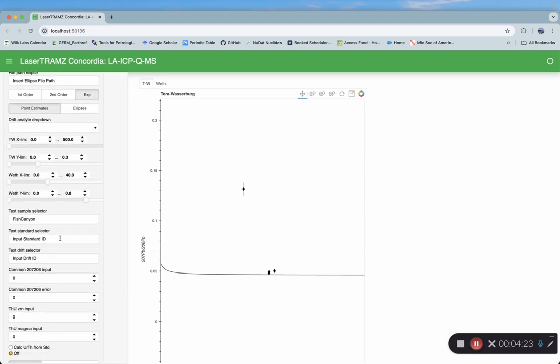Okay, the standard that you want to use to reduce the data, you will input that string here. You're going to get this little box that pops up. I'll go ahead and change the size of that so that it's bigger, but basically this just shows you mean, median. It's a box plot.